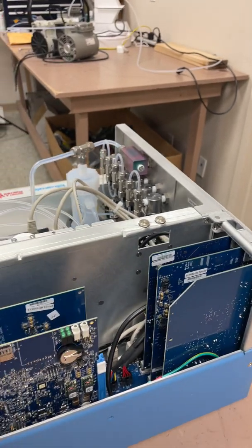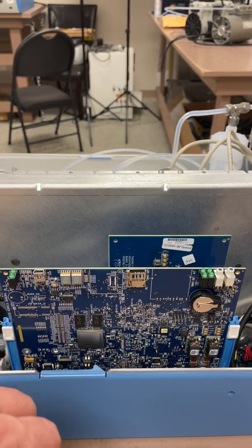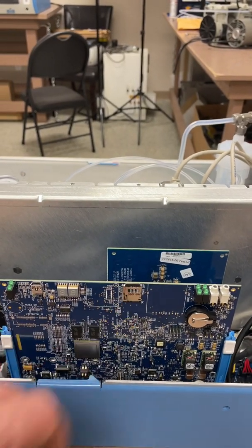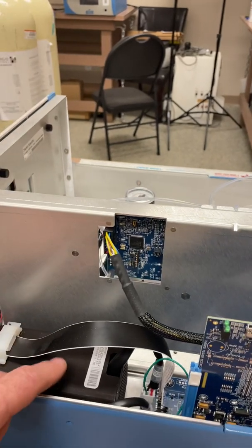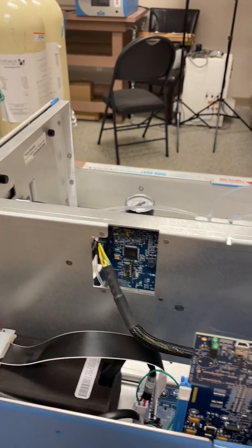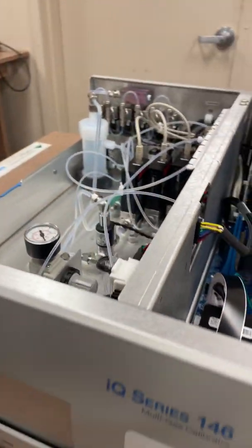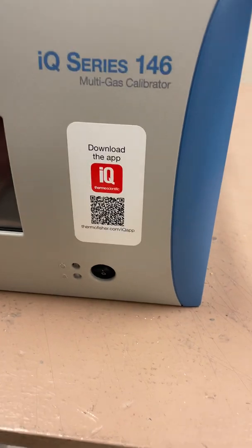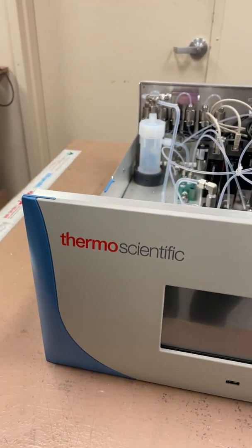Here's the processor card — this little SD card controls the program which runs the unit. We also have an AC to DC power supply down in here. So that is the 146IQ dilution calibrator from Thermo Scientific. If you have any questions, please feel free to comment — thank you.